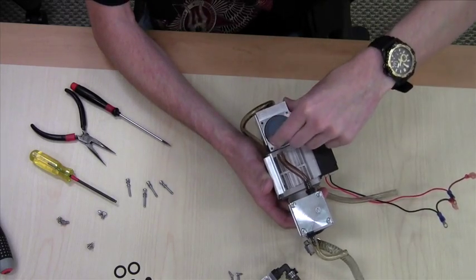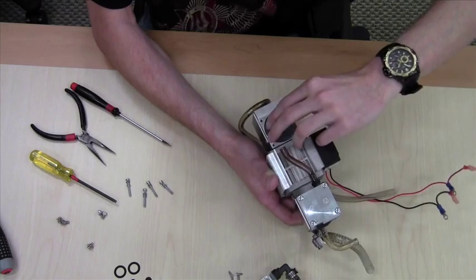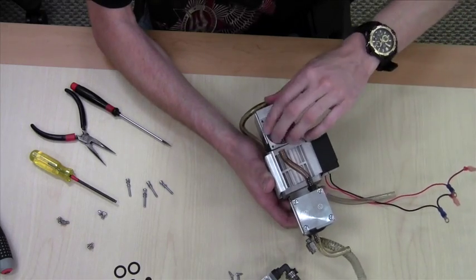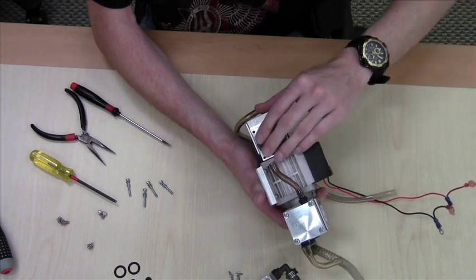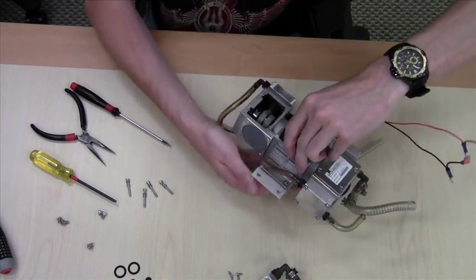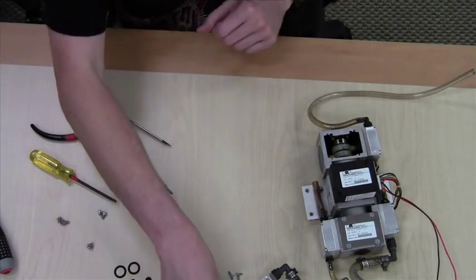Work the diaphragm in and make sure it is fully seated. Make sure there is nothing sticking out. Use tweezers or a small flat blade screwdriver, or whatever will fit in there.